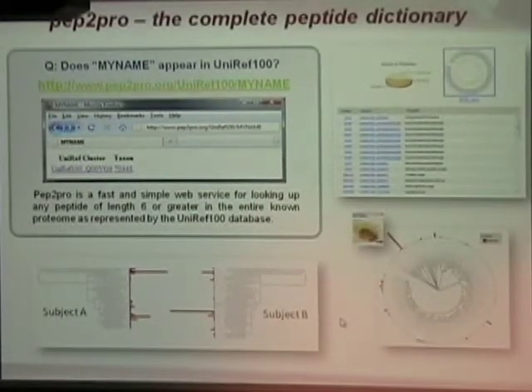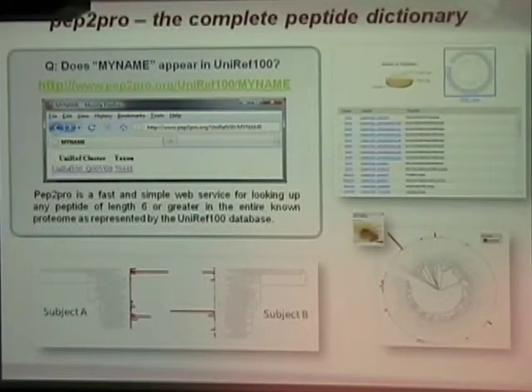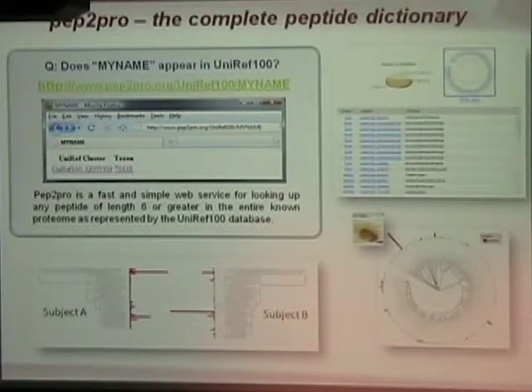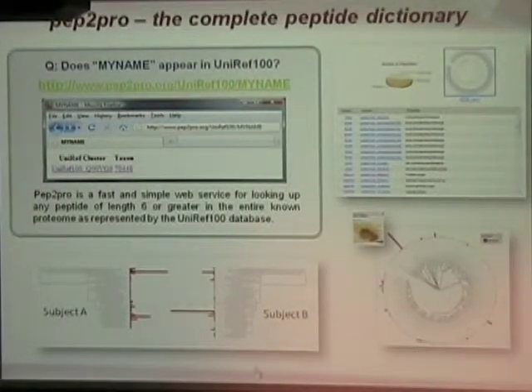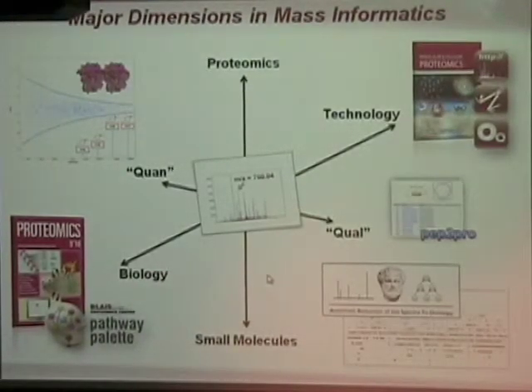The real use, if you will, is when you're doing metaproteomics experiments, when you're looking at mixtures that have peptides that truly are coming from multiple species. That's described in the relevant publication, and I'll add all of the relevant references when we post this. But basically, this is a simple, self-contained tool, which I like to start with because whatever happens, that's a very easy one to use.